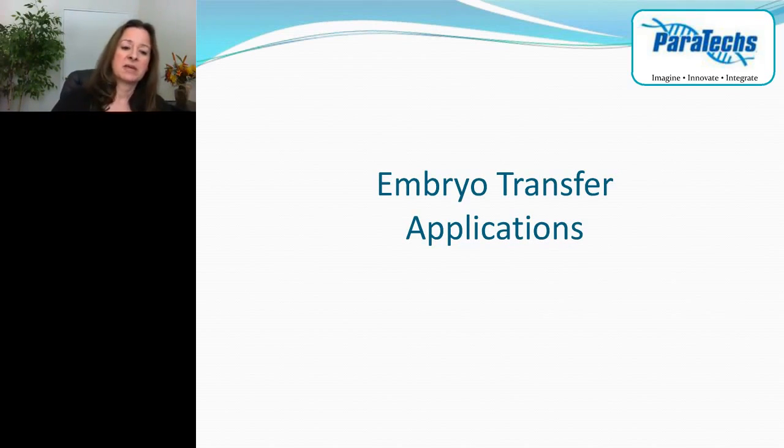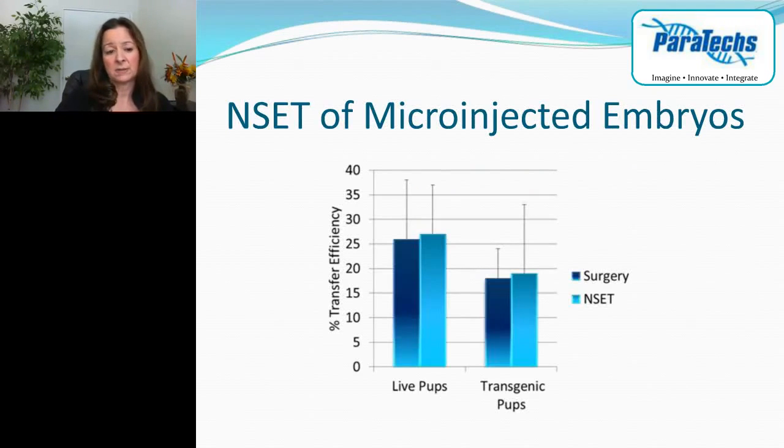So what are some of the applications to embryo transfer that non-surgical embryo transfer is applicable for? We've tested non-surgical embryo transfer with embryos that have been manipulated in various ways prior to transfer. And we have shown that NSET can be used to transfer microinjected embryos.